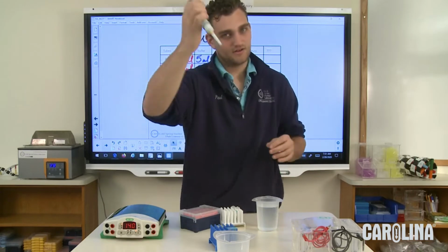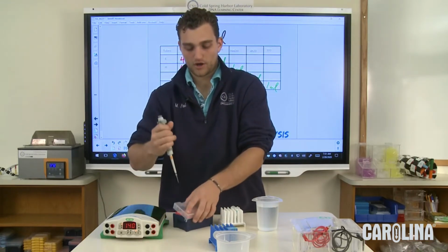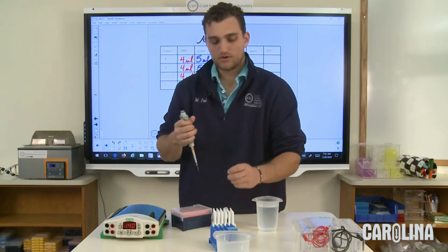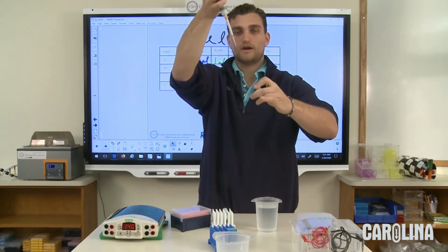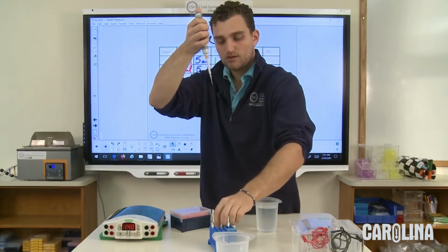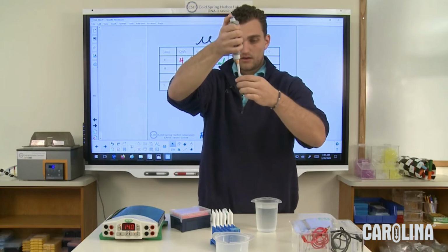Then, you guessed it, have to change your tips. Next one, the water. Going to take this down into the water. I grab a microliter. I put that into the minus tube right there.